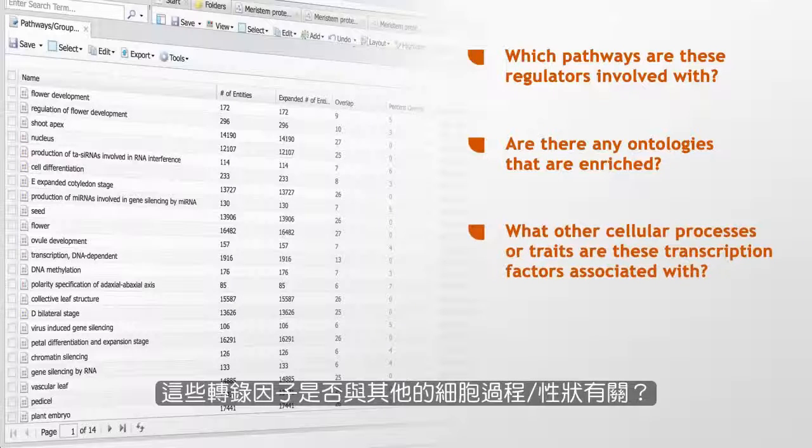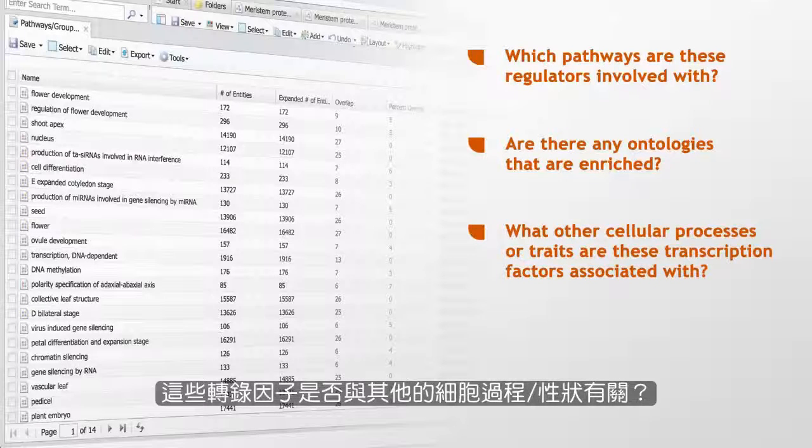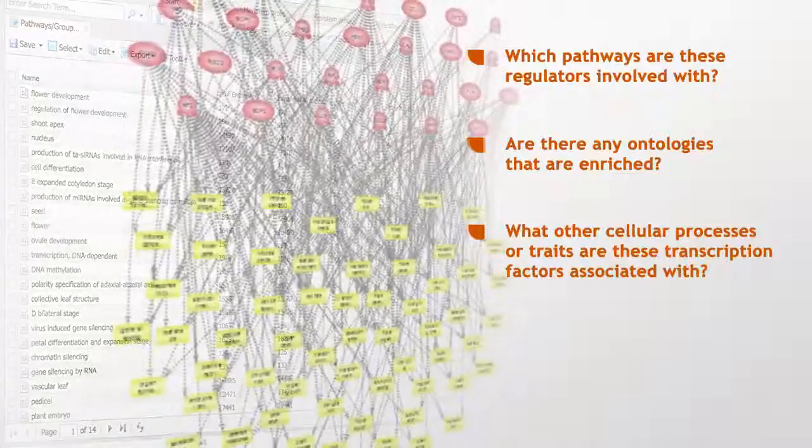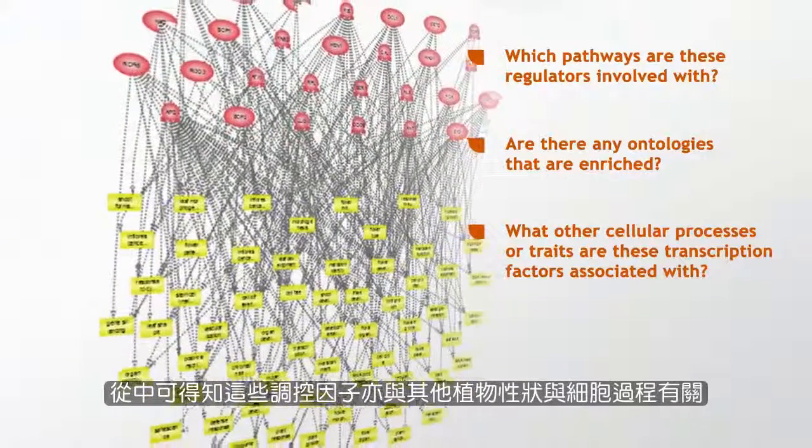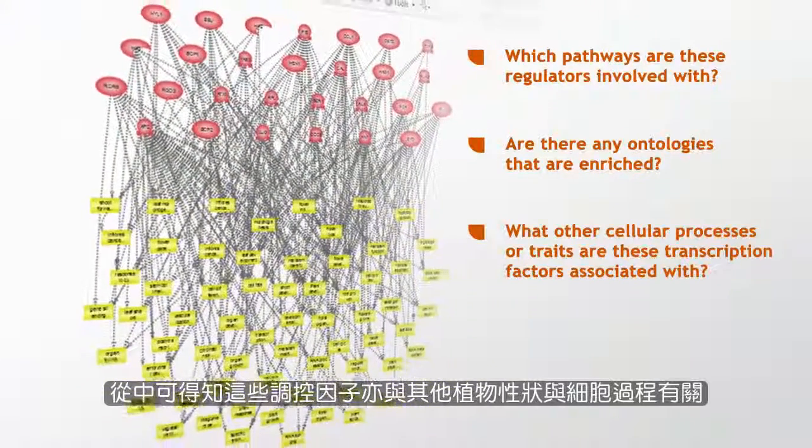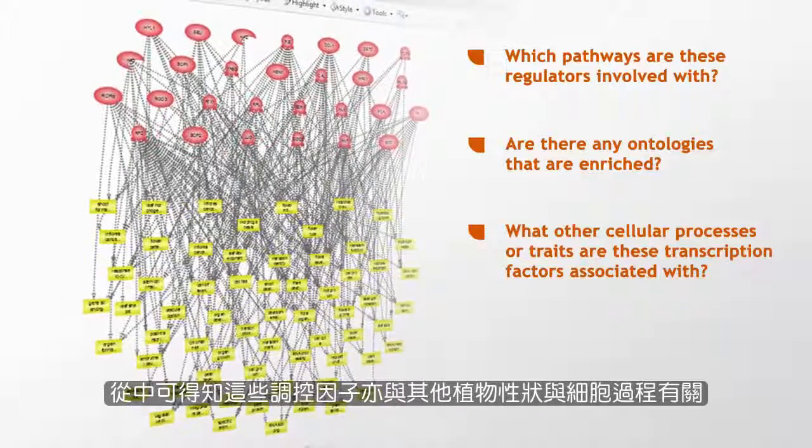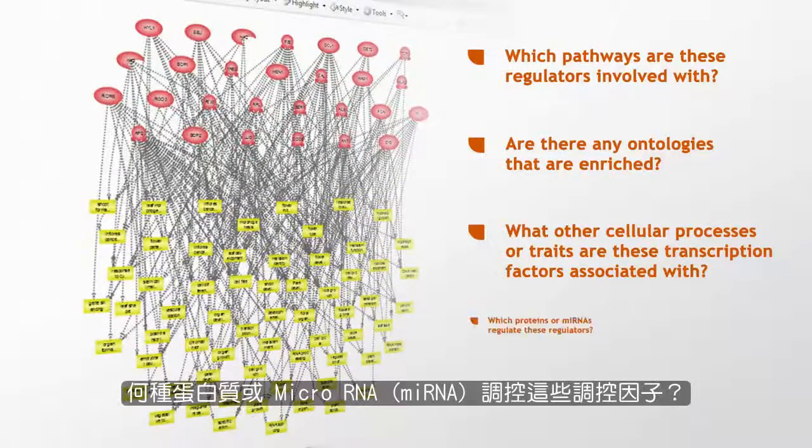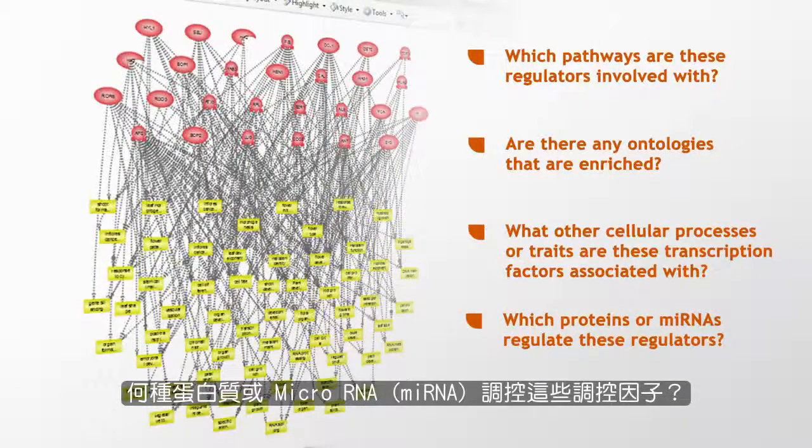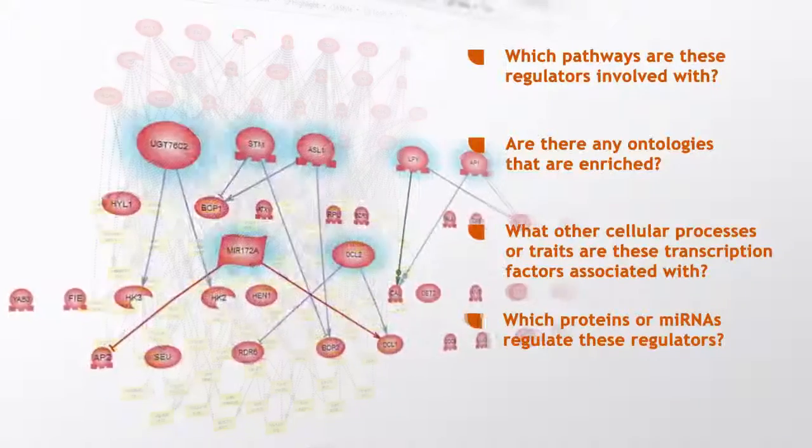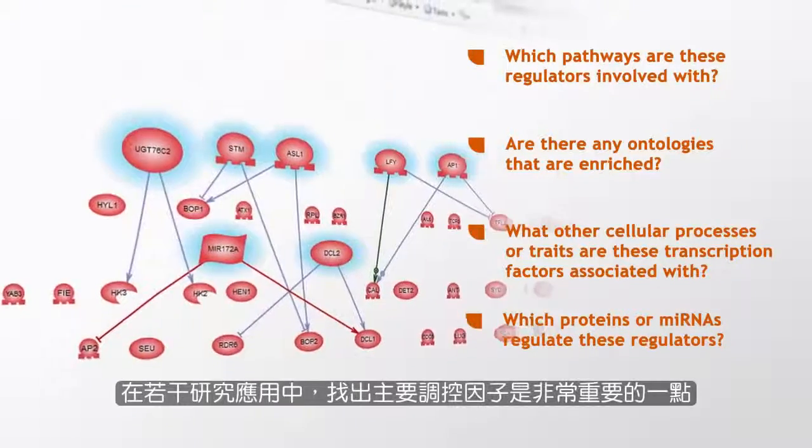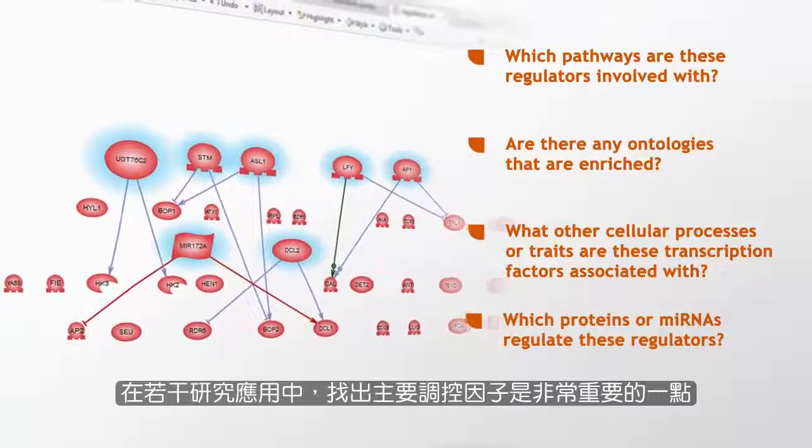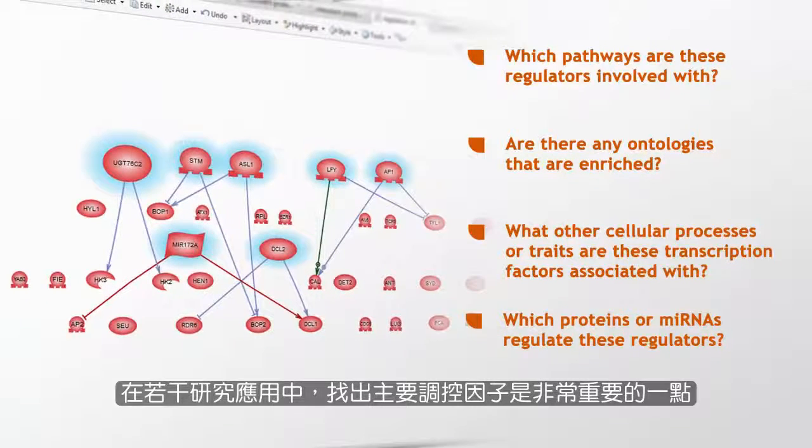What other cellular processes or traits are these transcription factors associated with? Here we see other plant traits and cellular processes that the regulators are also associated with. Which proteins or miRNAs regulate these regulators? Finding master regulators can be very important in certain research applications.